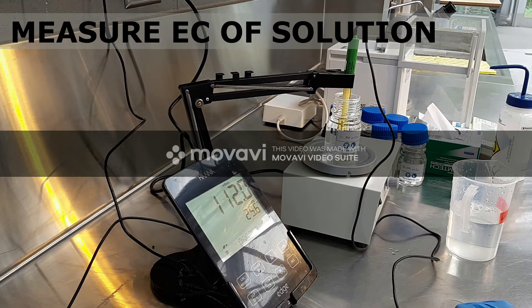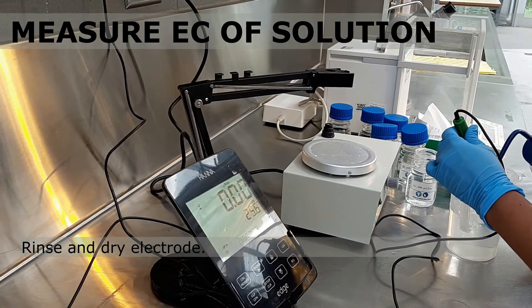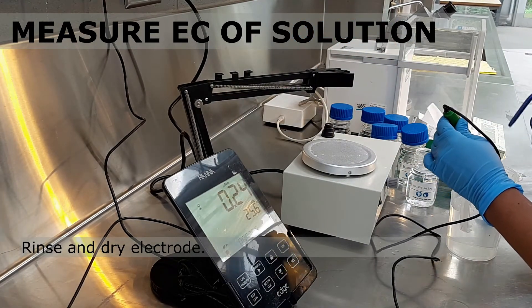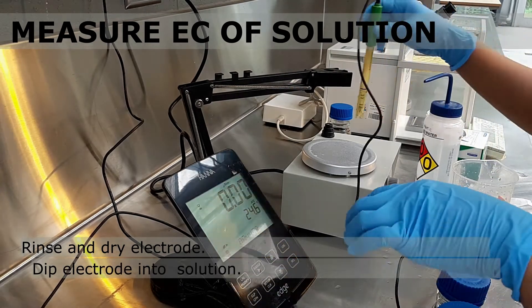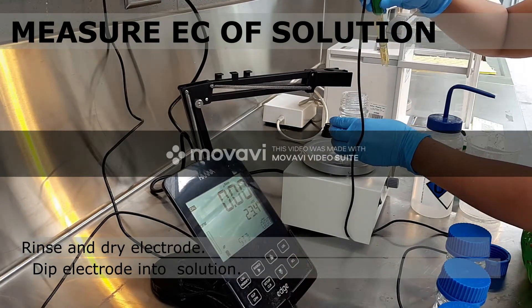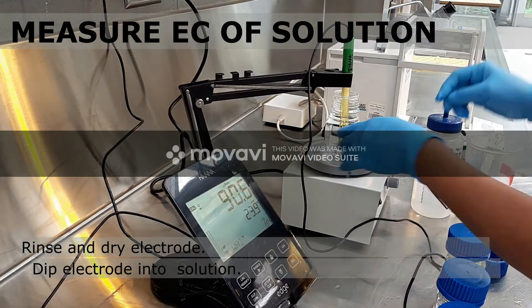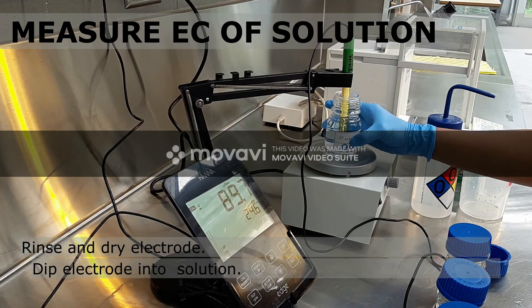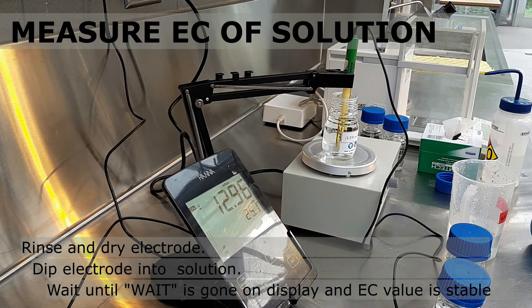Now we are ready to measure the EC of your homogeneous solution. To do this, make sure to use a clean EC electrode. Then submerge the bottom half of the electrode into the solution. Like in the calibration step, make sure the electrode is not touching the bottom of your flask. Then wait for the WAIT indicator on the display to disappear. The stable EC value shown on screen is your EC reading.